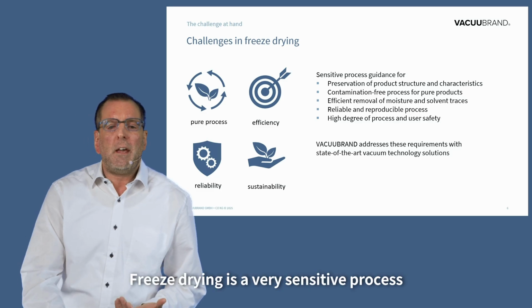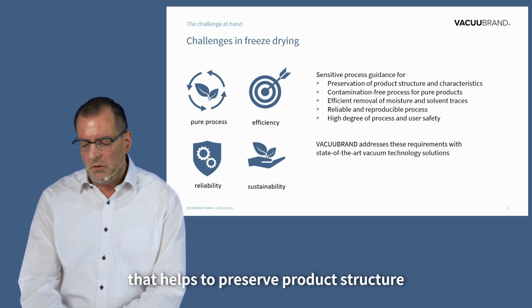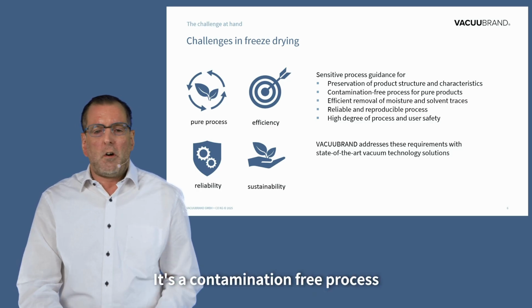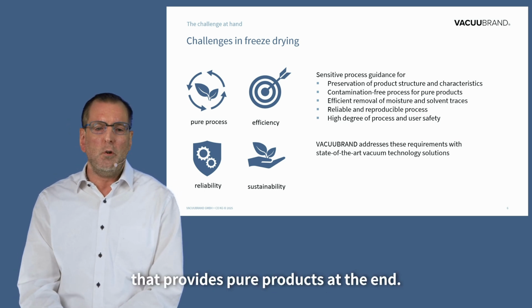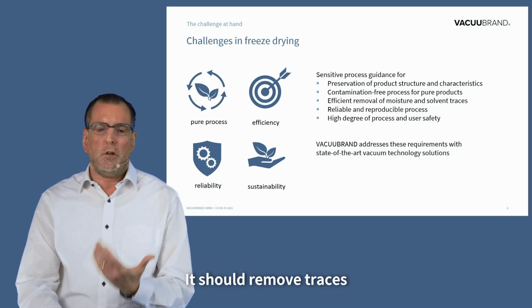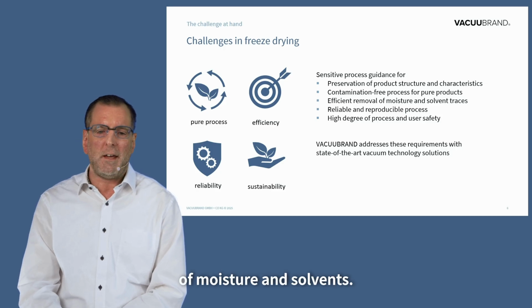Freeze drying is a very sensitive process that helps to preserve product structure and characteristics. It's a contamination-free process that provides pure products at the end. It should be efficient. It should remove traces of moisture and solvents.